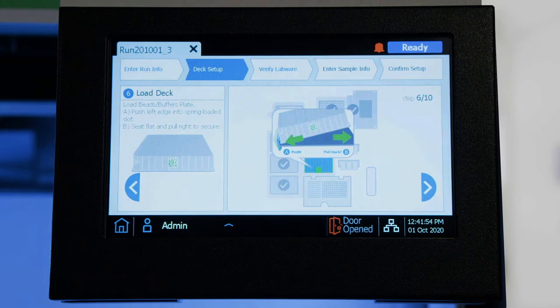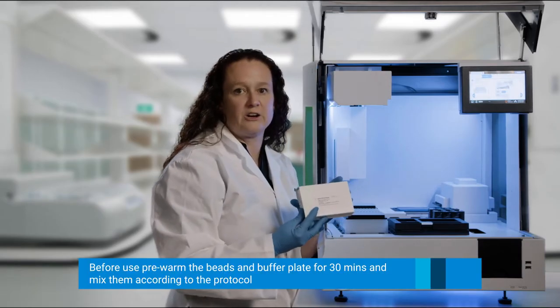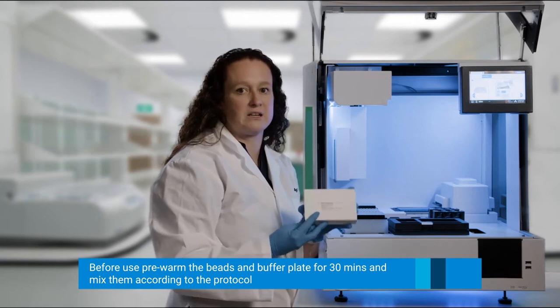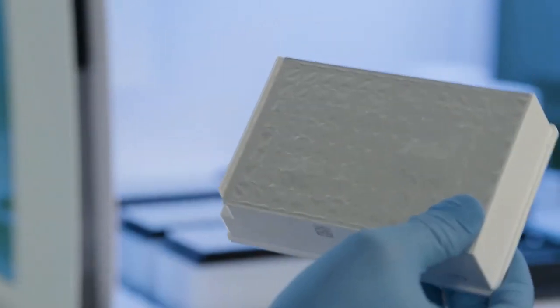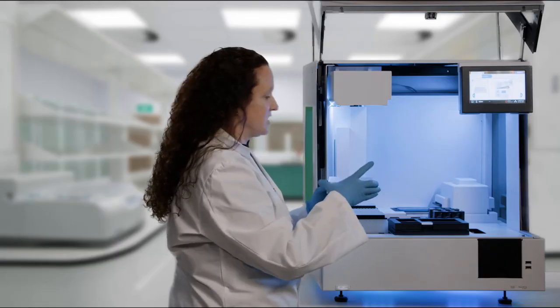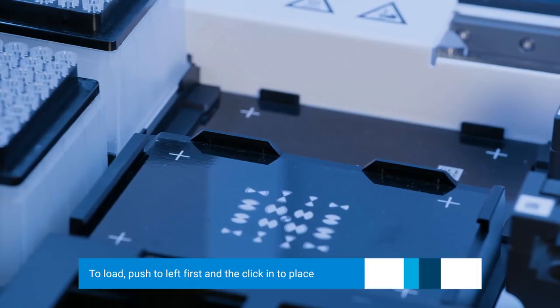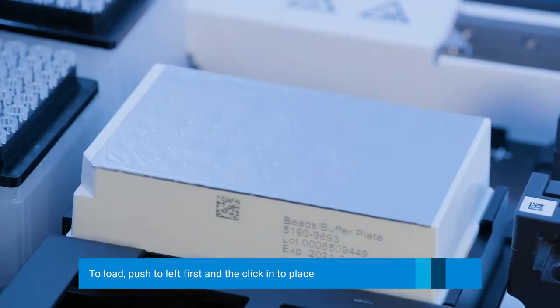Now we are going to add the beads and buffer plate. The beads and buffer plate is located in the refrigerator. You need to pre-warm it for at least 30 minutes and mix it according to the protocol. We have already done that, so we are going to remove it from its cardboard sleeve, put the barcode towards the front as indicated on the touch screen. It loads in a similar fashion to the heater shaker magnet — push it to the left and click it into place.